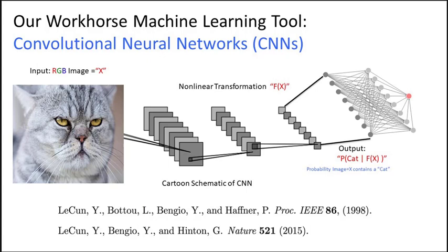What we're doing is, this is basically an array that we're going to be processing through a technique called convolutional networks, and I'll walk through exactly how this works at a high level in the next couple of slides. But then it basically extracts features for trying to figure out what is a cat-like feature, or what are the features that are encoded in this image, then passes that down in a feed-forward fashion to a classifier, like a logistic regression classifier.